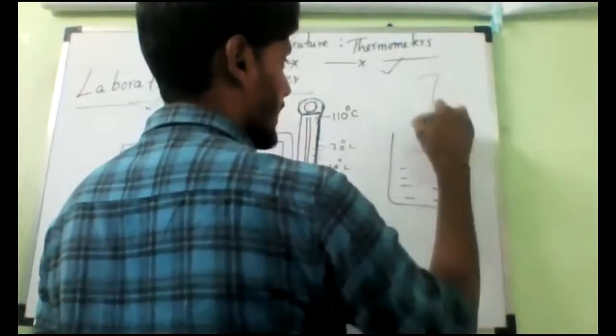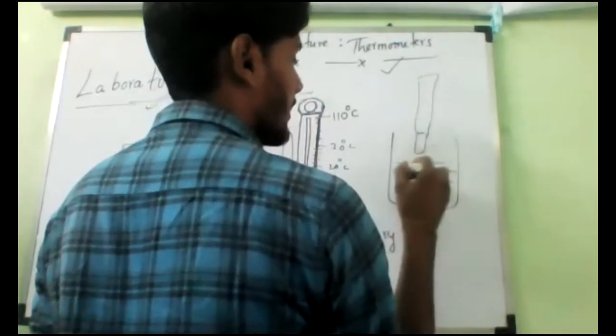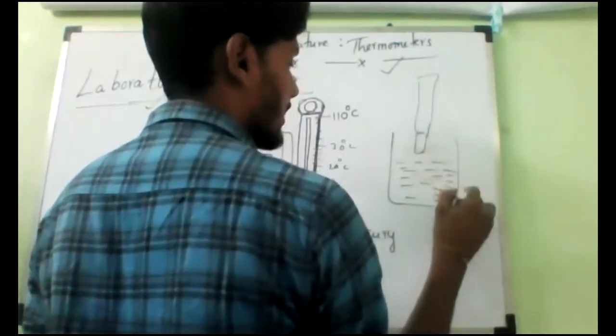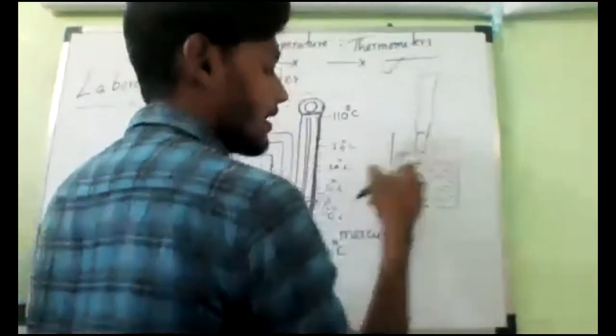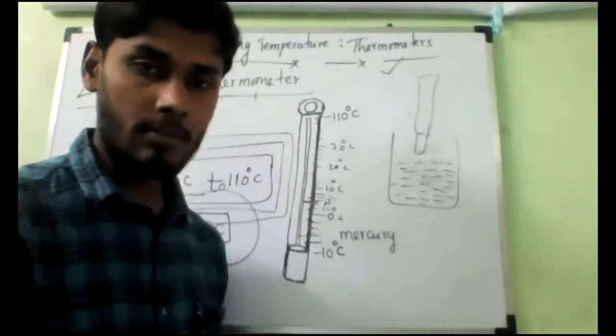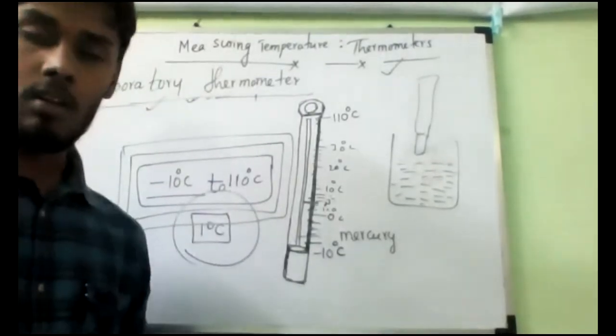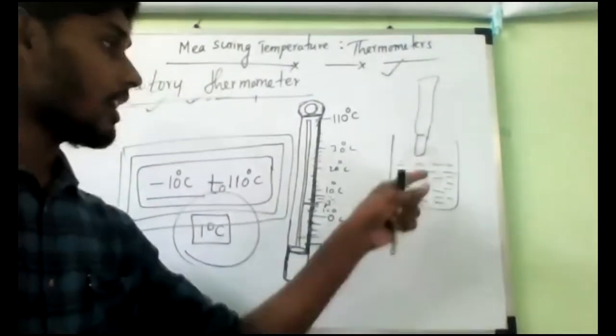No, sir. Because here I have kept my laboratory thermometer, but the water is present only till here. Will it show the temperature of the water? No, sir, it is not contacting.